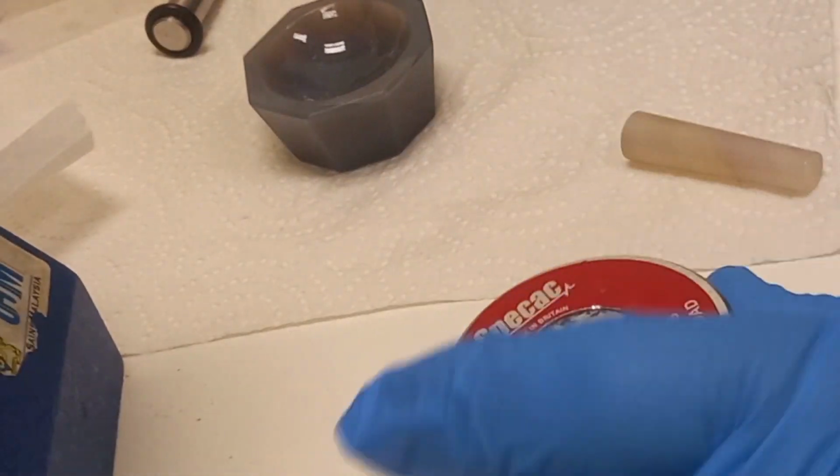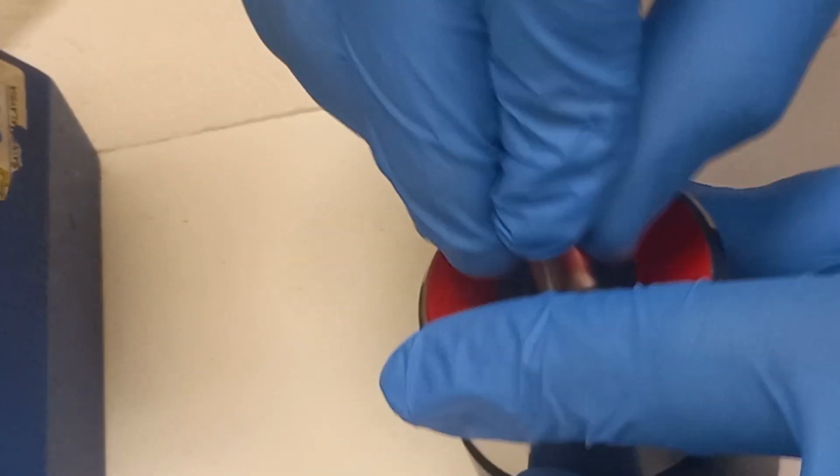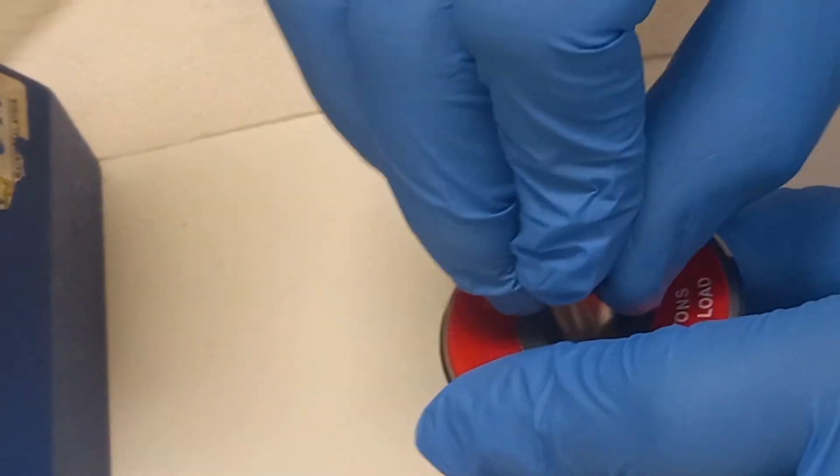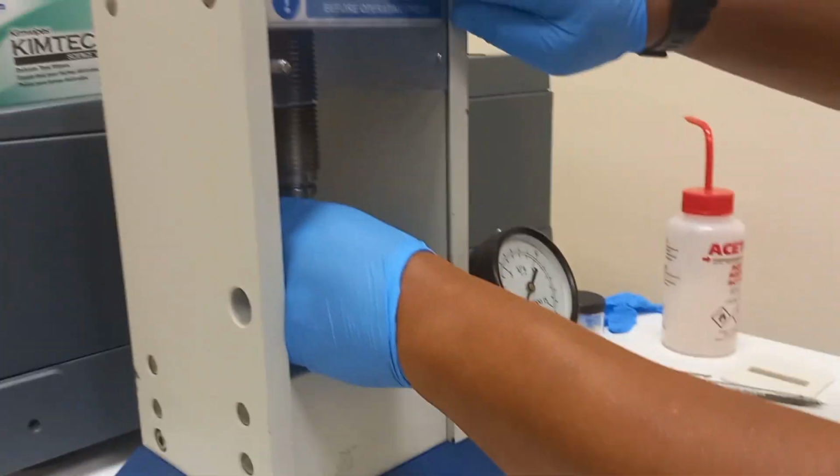So we'll place our sample as well as KBr and we'll crush it so that it may mix very homogeneously with the KBr powder, and then we'll keep it in a hydraulic press in order to press it and make it as a pellet.